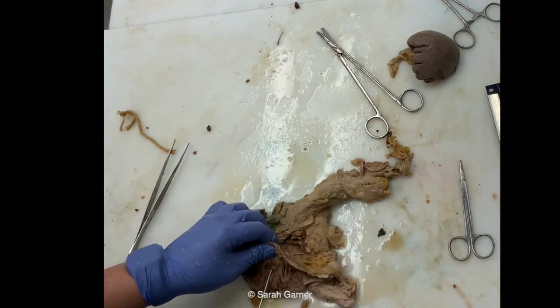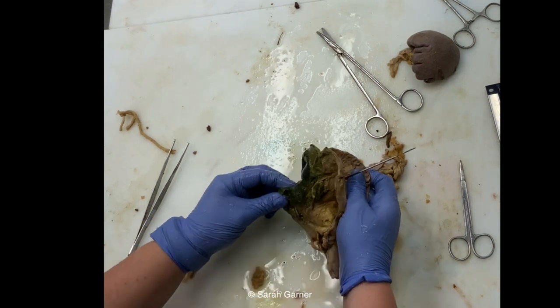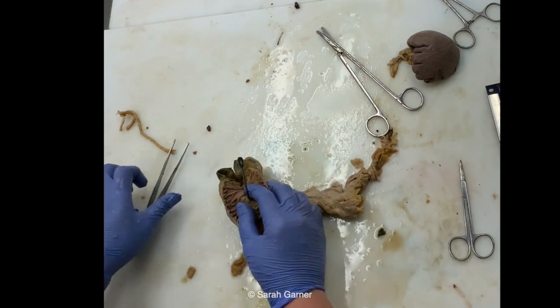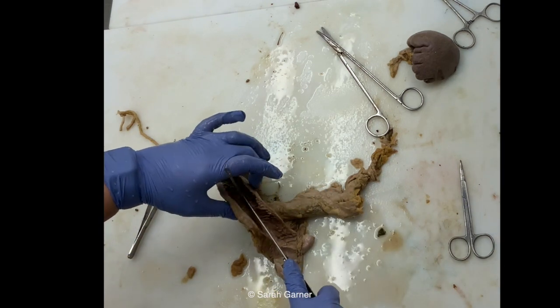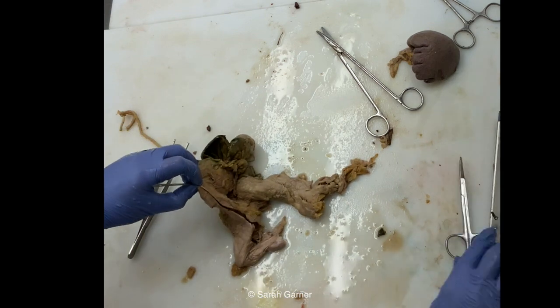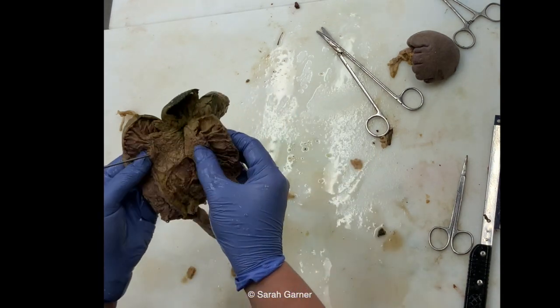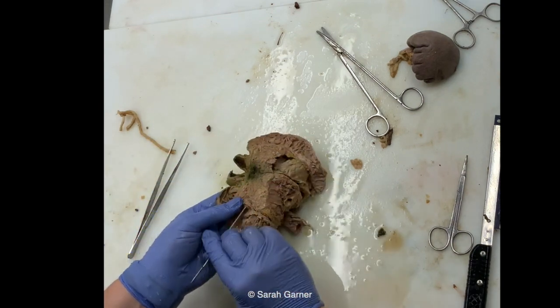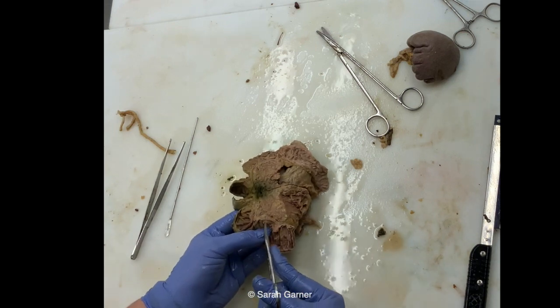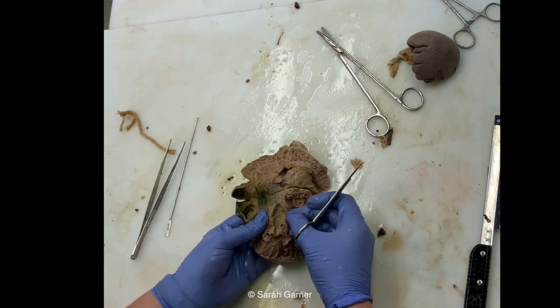And if you can get your probe in there and into the pancreas, then you can bivalve along there. Now, because this is fixed, again, I don't know how this is going to turn out, but we will try. We'll see how it goes. Most of it seems like it's still on this side, so it's a little bit off. So if that happens, you can literally just open it up along the duct.